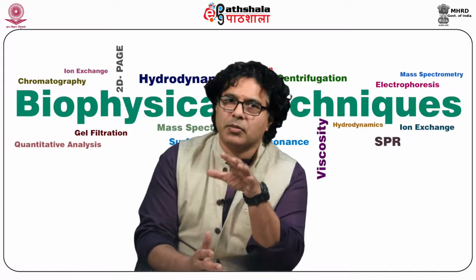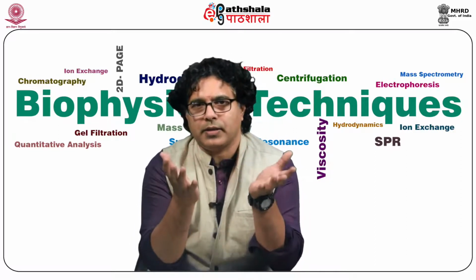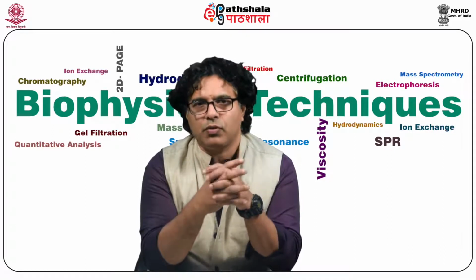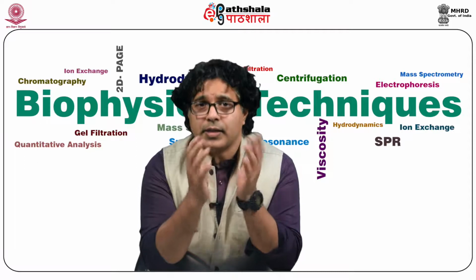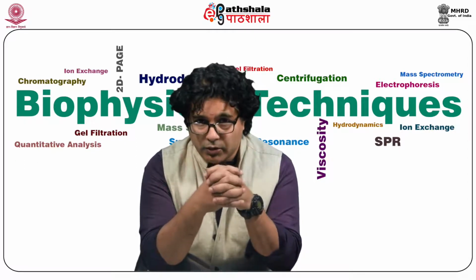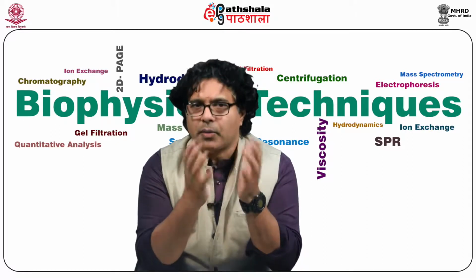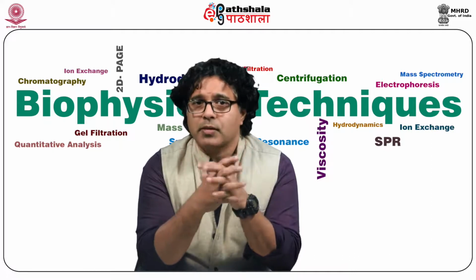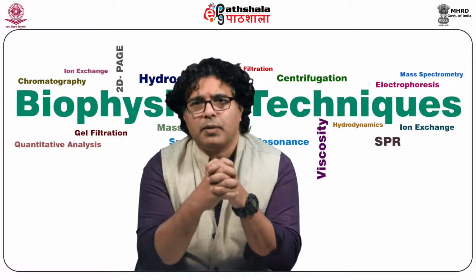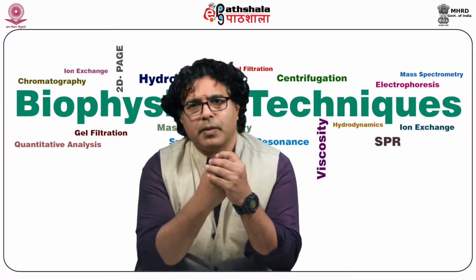Gas phase reactions in mass spectrometry are very important to understand what's happening inside this instrument. Mass spectrometry is an important structure information tool for chemists, and it is increasingly becoming an important tool for those in biological sciences, including those working in drug discovery, environmental toxicology, proteomics, biomarker analysis, metabolism studies, and even those working with newborn metabolism screening.